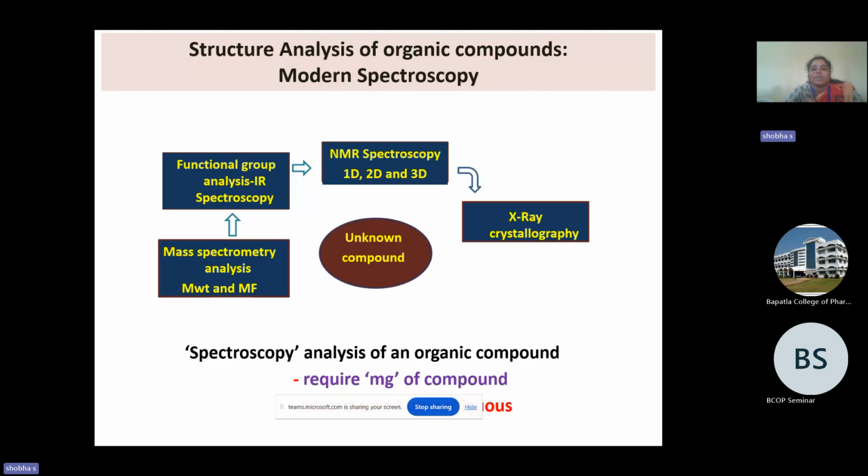With respect to students, they may stop at IR itself only. They only extract, then go for the analysis by means of IR. But we are not confined to the IR, we may go for other utilization of advanced instruments, how they are helpful for us to know the structure completely.